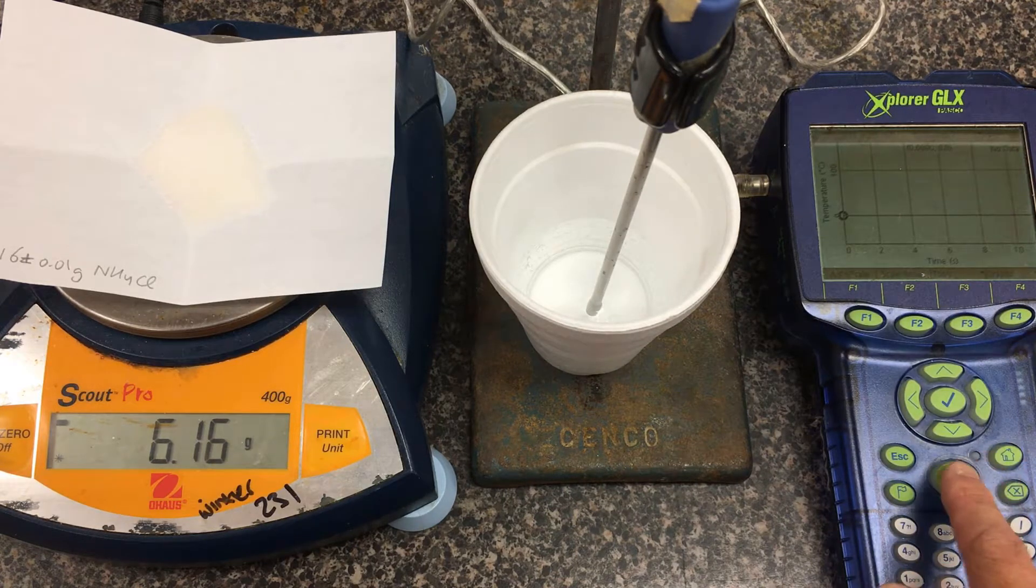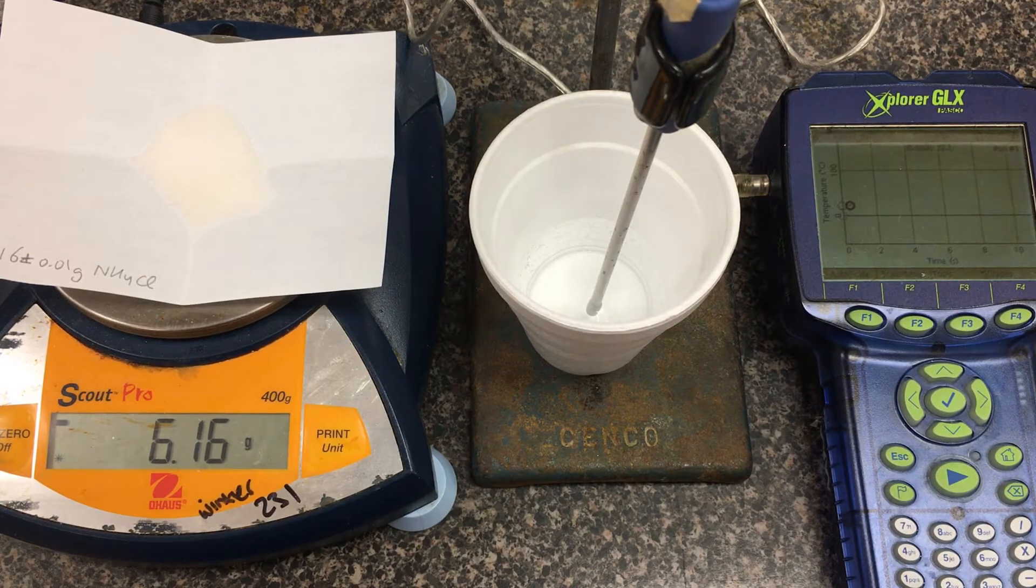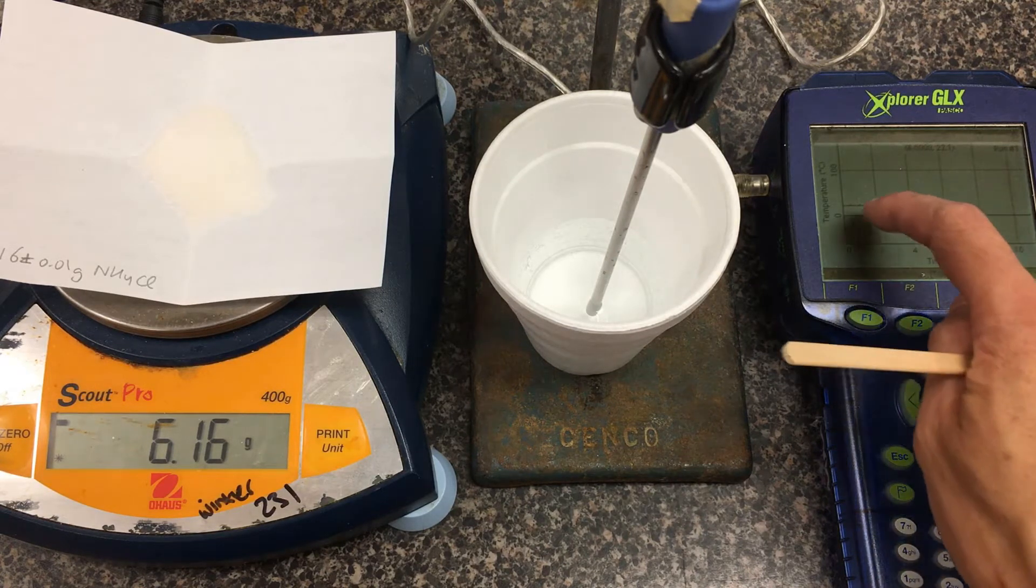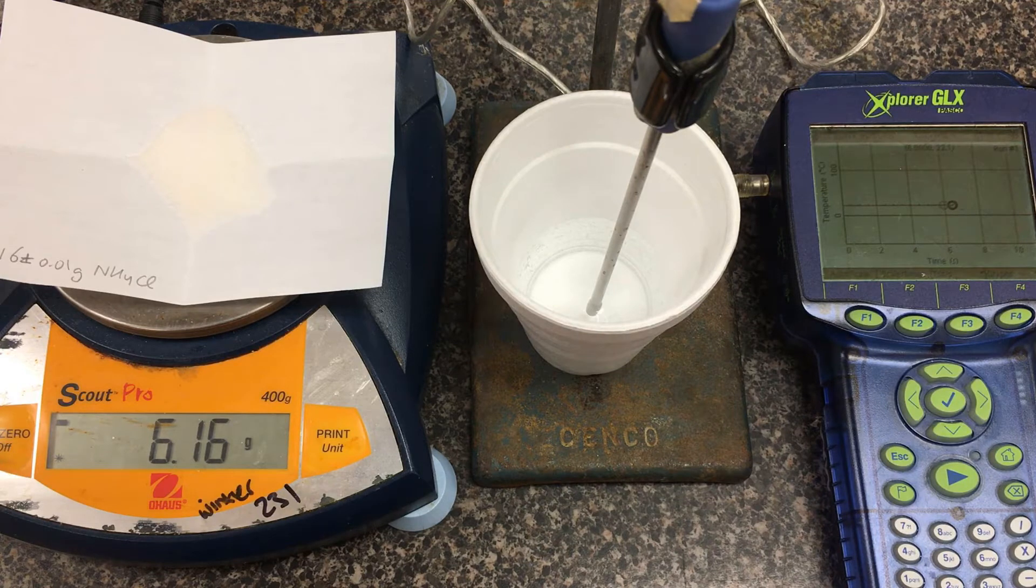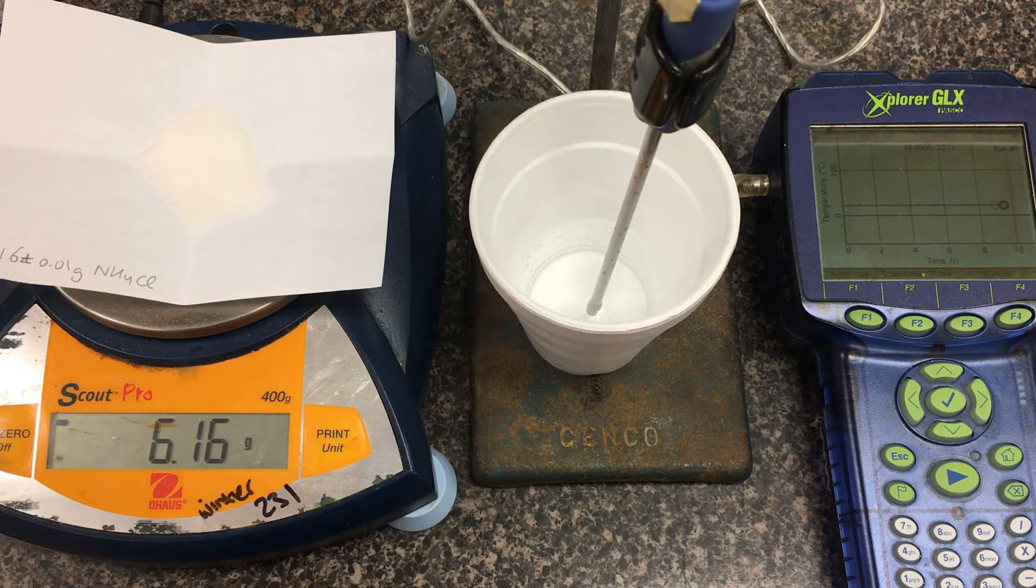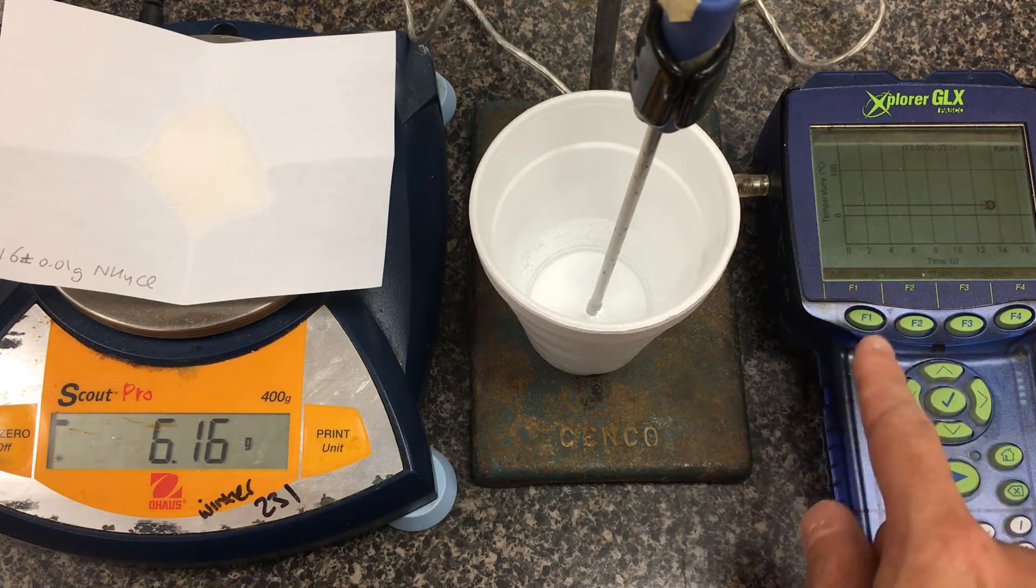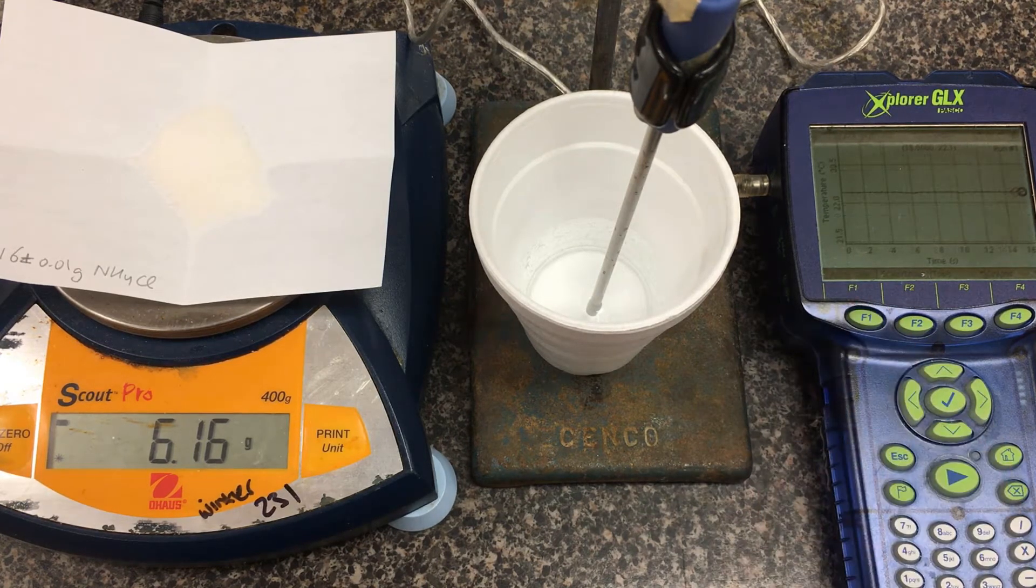To begin, we're going to press play to start a run. It's already starting to sample the temperature. If you can see the scale there, we're roughly about 20 degrees. I want to give it a baseline so we can get a starting temperature reading. It might be nice to press F1 to auto-scale it to zoom in a little bit.